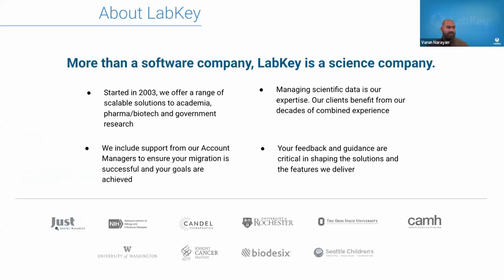And really, when it comes to us identifying new features and new products, we heavily rely on feedback and guidance from organizations just like yours. And honestly, that's how our Biologics LIMS product came about. We had heard time and time again about these real issues that people were facing in the scientific community that had little to no real solutions. So let's touch on those real quickly.